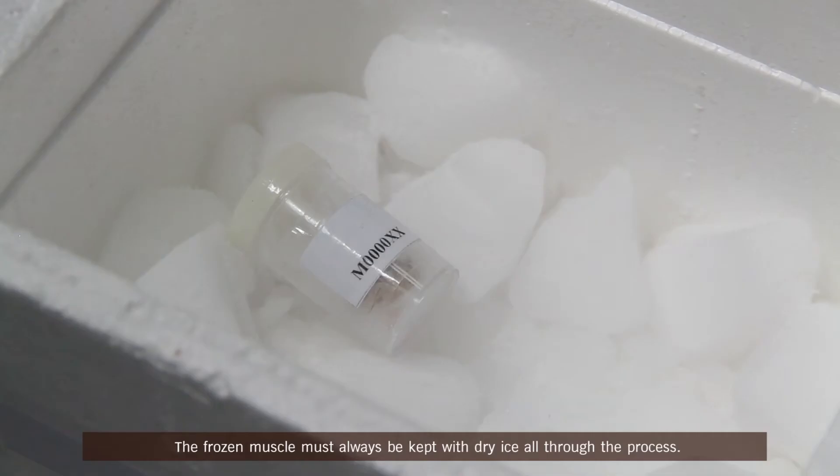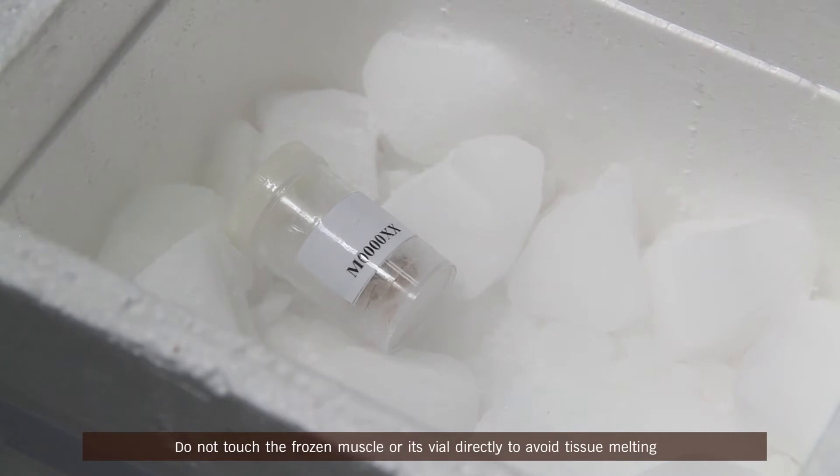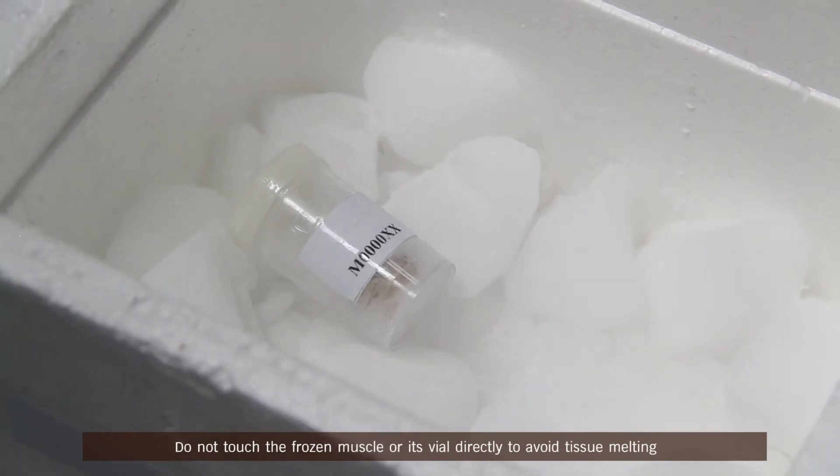The frozen muscle must always be kept with dry ice all through the process. Do not touch the frozen muscle or its vial directly to avoid tissue melting.